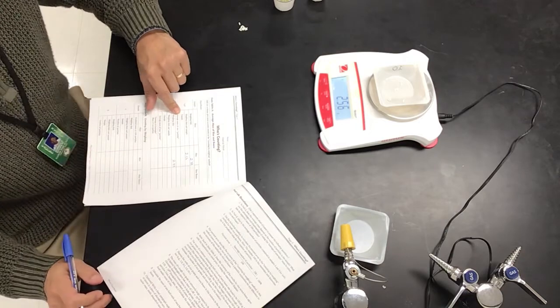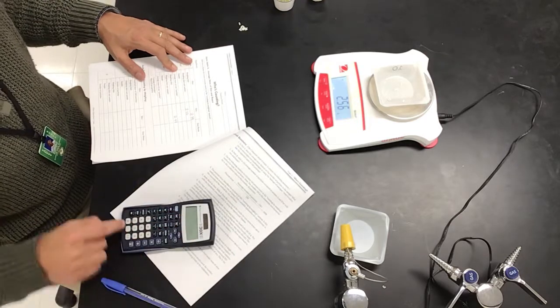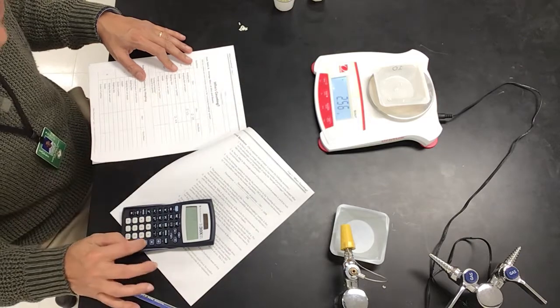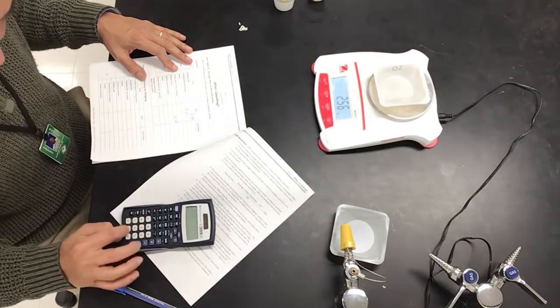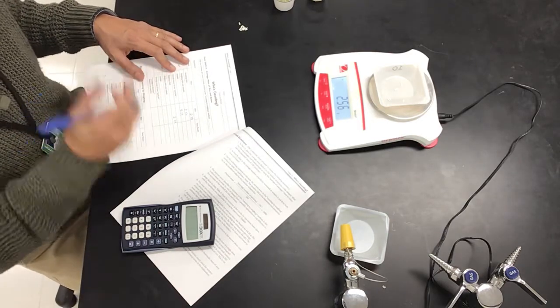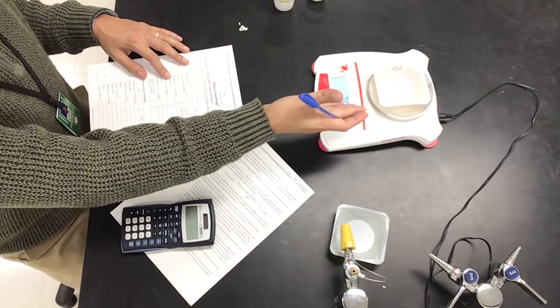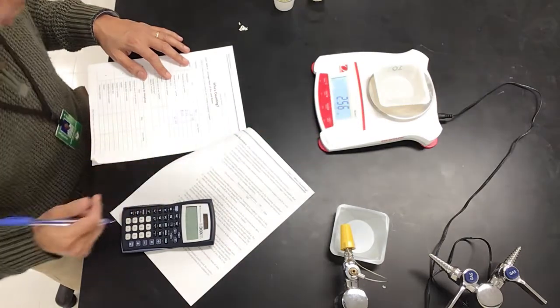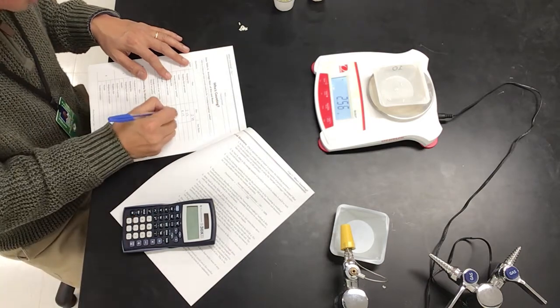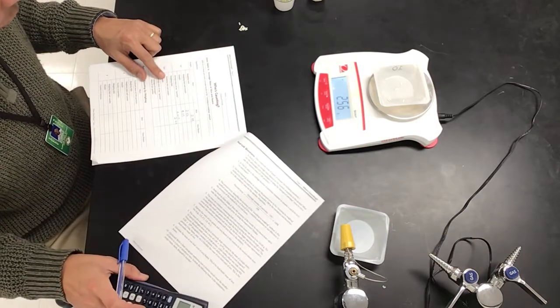So now they ask you, what's the weight of the sample? What's the weight of just the 10 grains of rice? 2.56 is everything. If we subtract the empty dish, which is 2.39, you get the weight of 0.17 grams. That's just for the rice. And it says average mass of 1 particle, 1 grain of rice. So we take the total mass of 0.17 divided by 10. It gives you the mass of 0.017 per grain of rice.